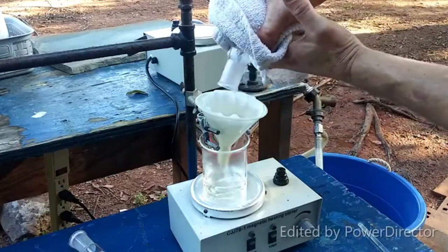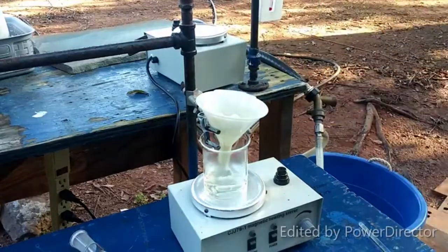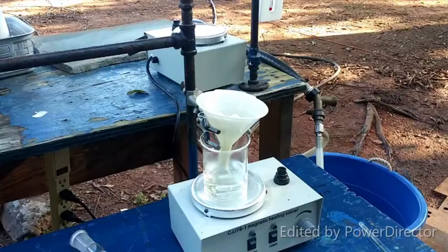As usual, it's just a cotton plug — or actually, no, I think this is just a coffee filter system. I didn't want it to take a long time to filter.